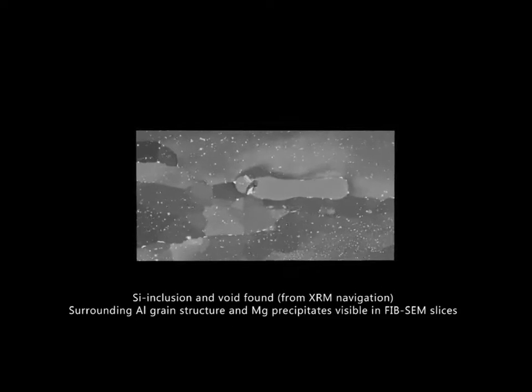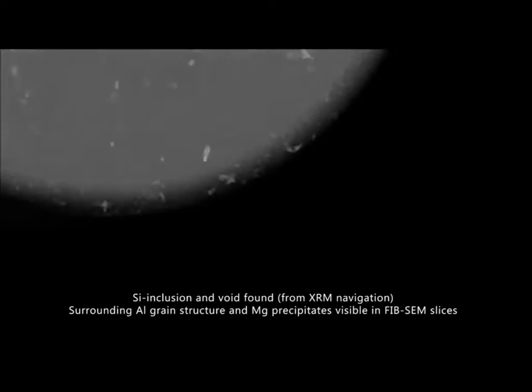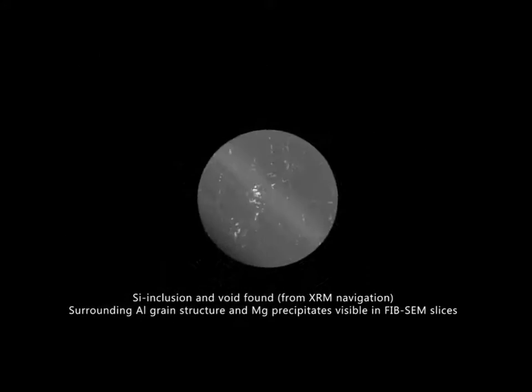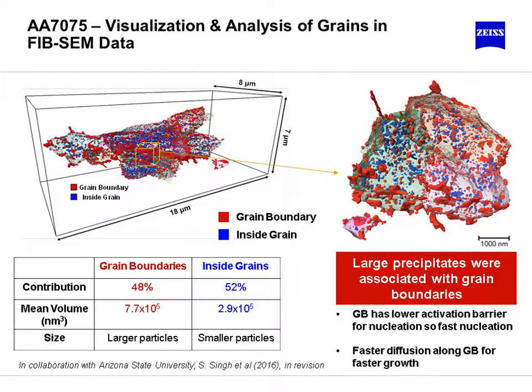So Atlas V allows you to perform that experiment. So this is some of the visualization. This is in the end the FIB-SEM stack. This is acquired here a few tens of microns in field of view here with a voxel and slice dimension here of around 10 nanometers. Of course, you can extend that below 10 nanometers. In this case, it was done approximately in that range.